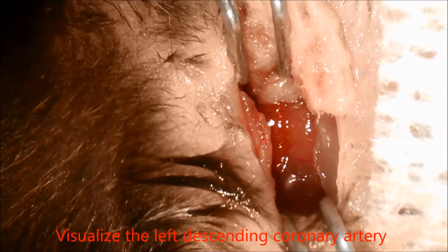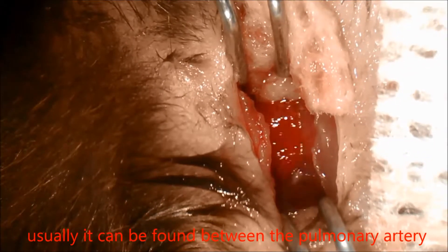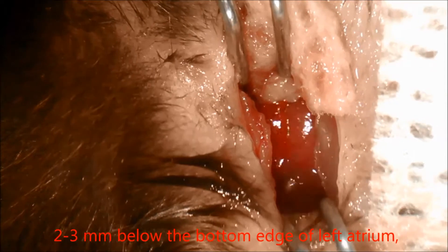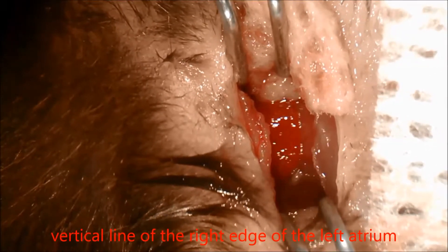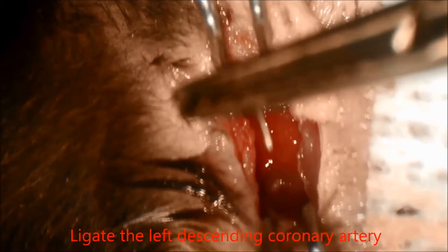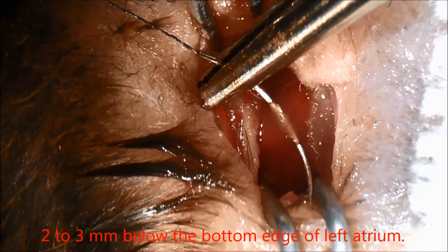Visualize the left anterior descending coronary artery as a deep-positioned light red vessel, usually found between the pulmonary artery cone and the left atrial appendage, 2-3 mm below the bottom edge of the left atrium, in the area between the right edge of the left atrium and one-third from the left edge of the left atrium. Ligate the left anterior descending coronary artery using 7-0 silk suture at the position 2-3 mm below the bottom edge of the left atrium.